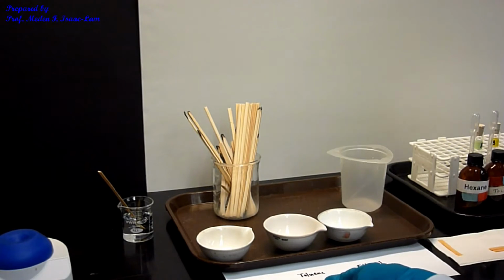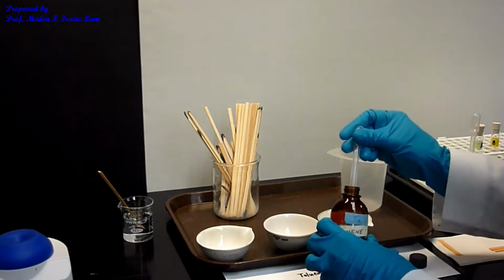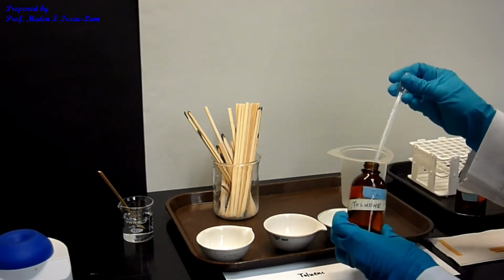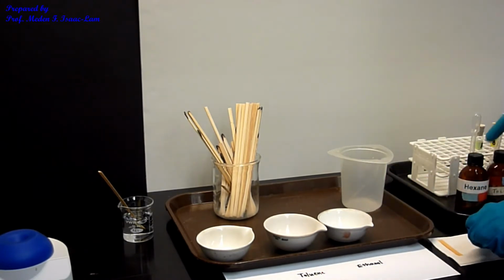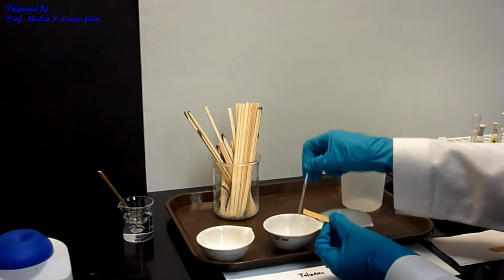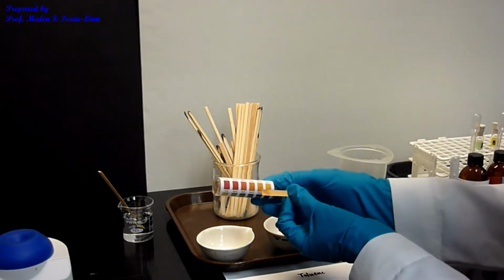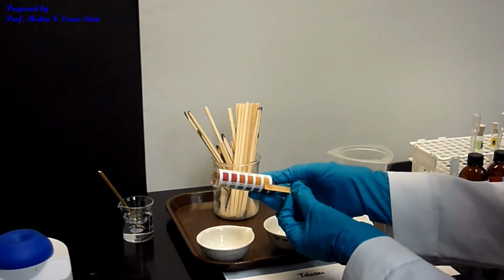So now we're gonna do toluene. So now I'm gonna do acidity first. So again, 8 drops. Toluene this time. Okay, sample. 1, 2, 3, 4, 5, 6, 7, 8. Okay. So I'm gonna do again with the stir stick. So I can use the other side of this paper and then stir stick. So again, it's the same. So the color is still 6. It's about yellow-orange. All right, pH 6 for toluene.